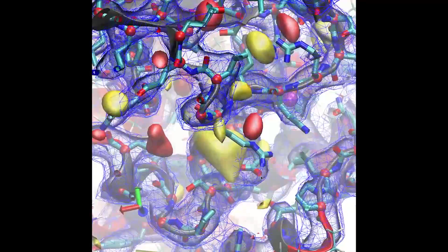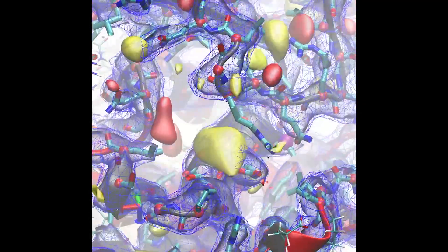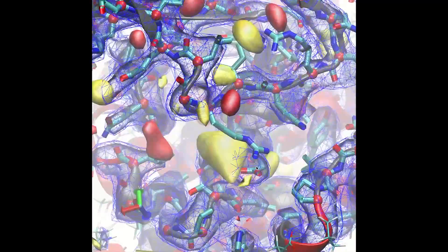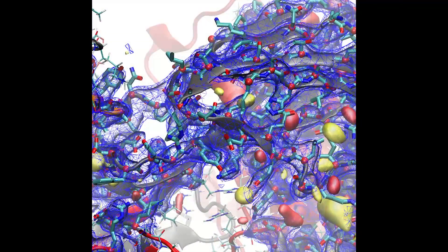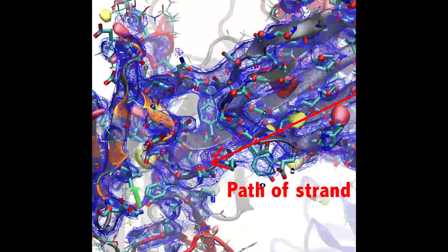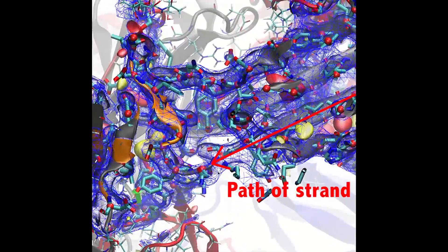Right now we're looking at the C terminal end of the first out of register stretch, which has been thrown out by fitting of an ideal alpha helix where there is actually a two residue outfolding. As we trace back through the chain we see that the nearest beta strand actually looks quite reasonable and signs of error mostly appear in the flanking loops.